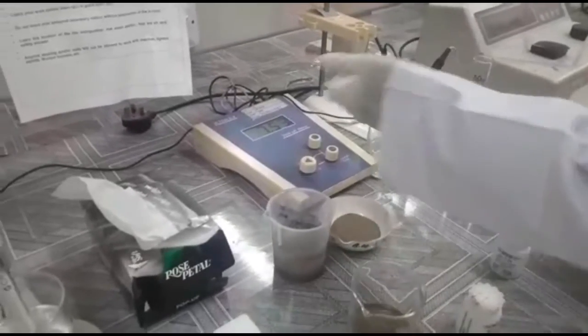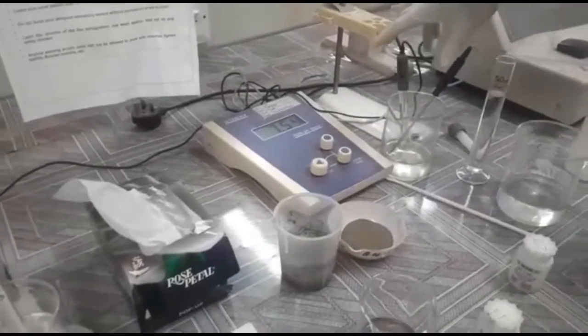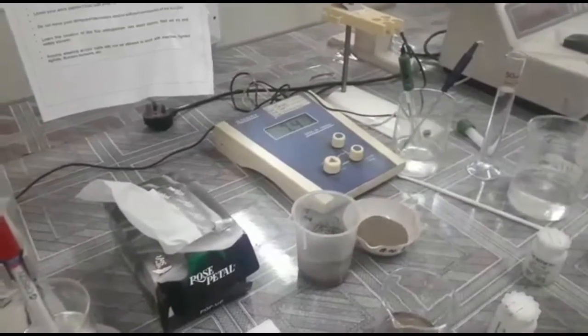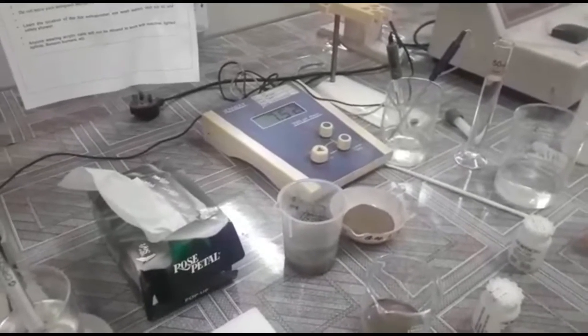After waiting, suppose it reads pH 7.54. After completing this, we have to again wash this and dry it and keep it for the next procedure.